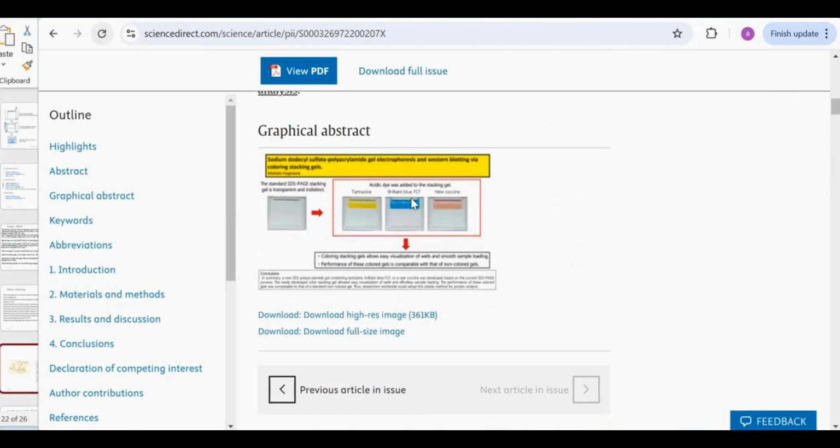You can check the purity of proteins. How can you check the purity of proteins? If it is run, it should give a single compact band. If there is more than one band or a fuzzy band, you are going to say that it is not a pure protein, right? Of course, addition of a metal ion or a ligand also can change the properties or characteristics of the zones that are formed.